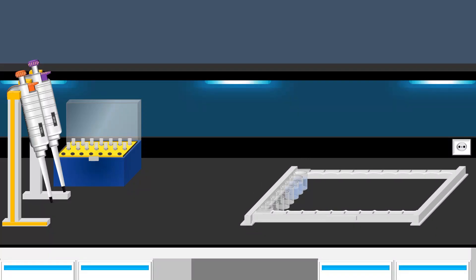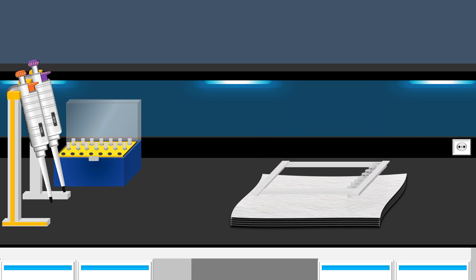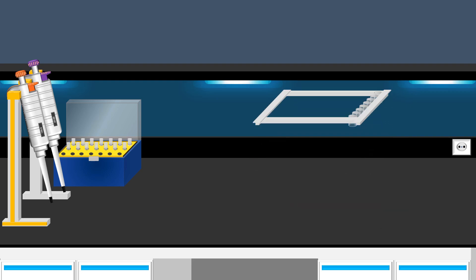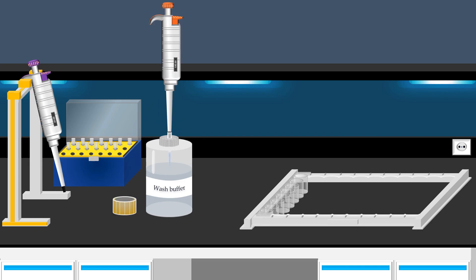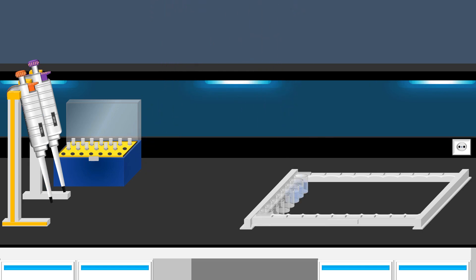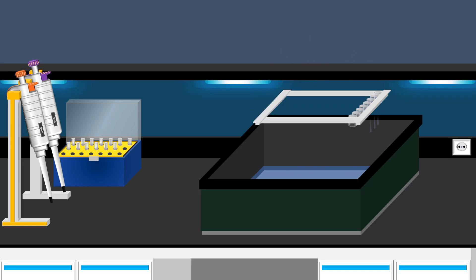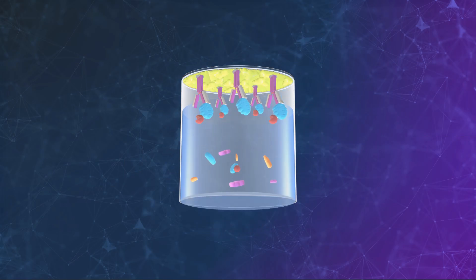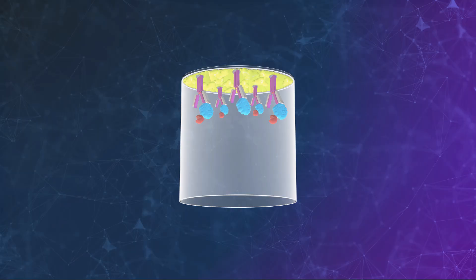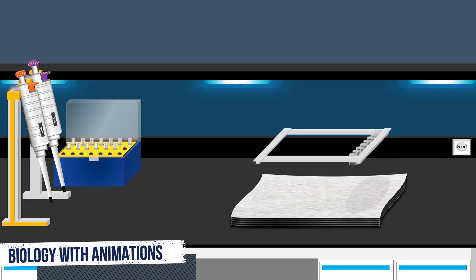After incubation with the samples, the solution is removed from each well. Subsequently, a paper towel is used to eliminate any remaining liquid. The next critical step is to perform a thorough wash to remove any unbound substances. The washing step effectively eliminates unbound substances, leaving behind only the specific antibody-protein complexes. After discarding the wash buffer, an absorbent paper towel is used to eliminate any remaining liquid.